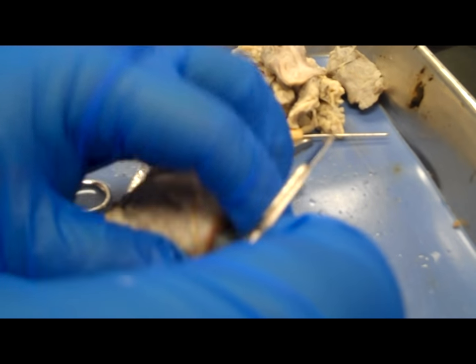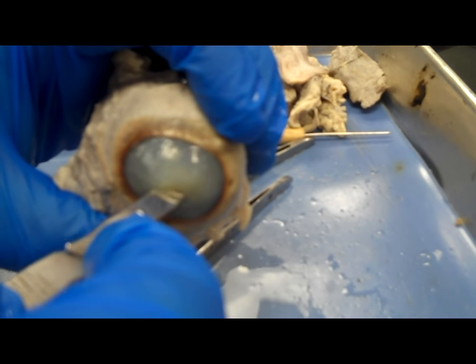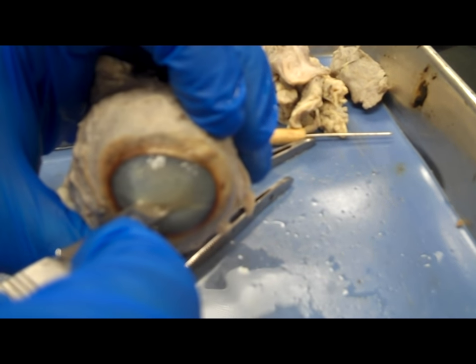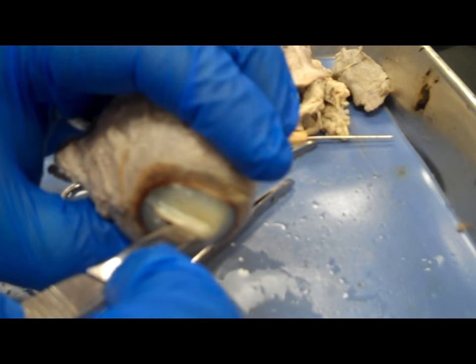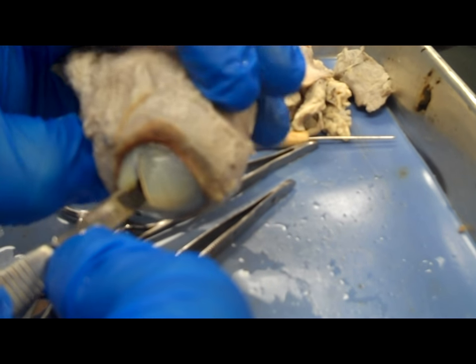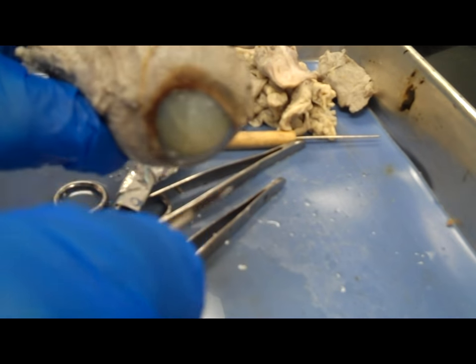You're going to see some liquid come out. That liquid is the aqueous humor — the liquid that's underneath the cornea, between the cornea and the lens. You can see a little bit of that aqueous humor drain out at this point.